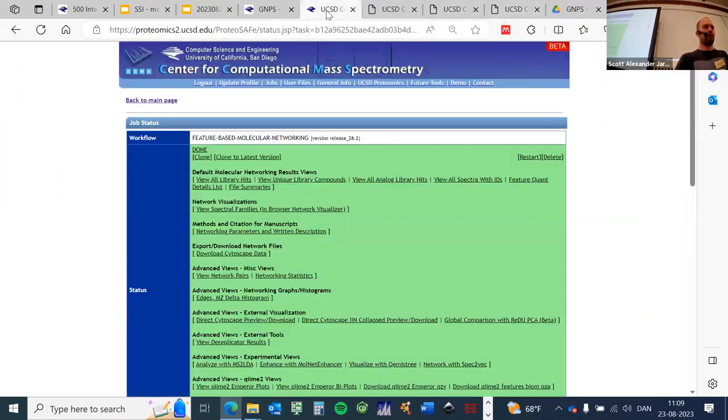So now this shows the network in a node-centric view, only the molecular family of compounds connected to this one. What about all the rest? Those you can't really visualize in this particular viewer, but we can download all this data. Everything that is accessible online, we can download on our computer and then use advanced network visualization tools such as Cytoscape. Therefore, we can click here on download Cytoscape data. I'm actually going to do this to show you.